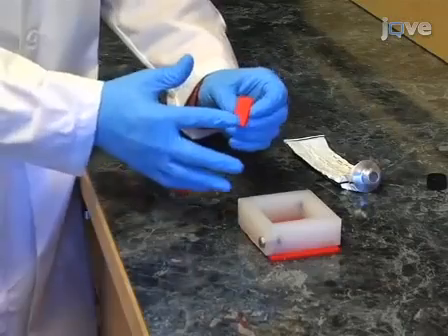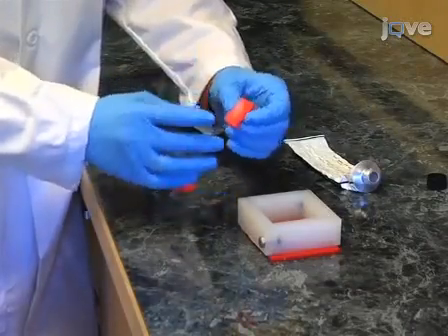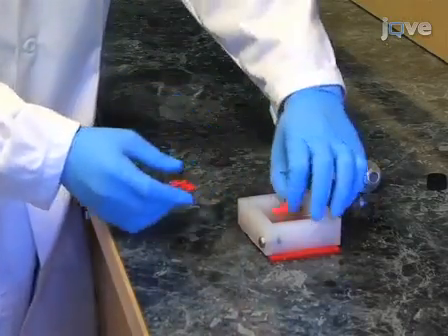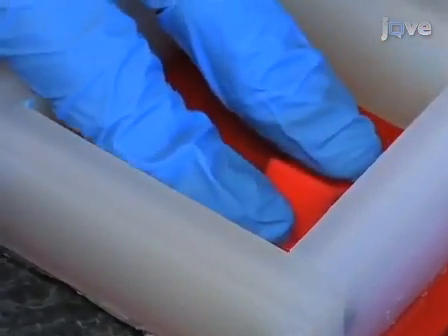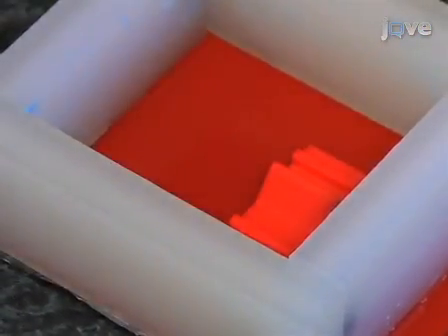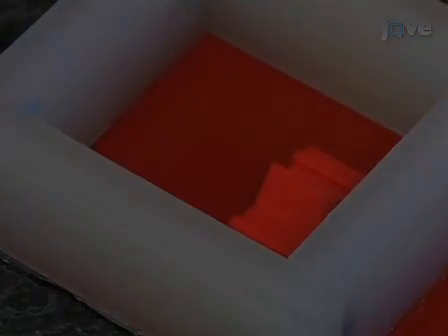Place a small amount of vacuum grease on the lateral side of the solid model of the desired geometry. Press the model into the bottom of the mold form cavity, vacuum grease side down, so that the vacuum grease holds the part in place.